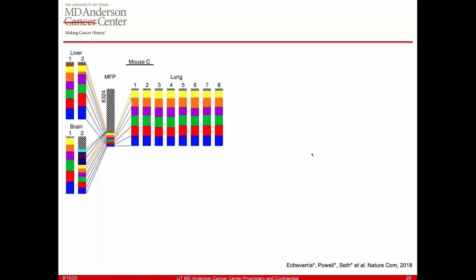Now, apart from looking just at the distribution, we can also track specific lineages. So here we are looking at the top lineages, represented color-coded. What we see is it's actually the same set of lineages which are represented in lung and liver. The yellow, orange, purple, their numbers and the fractions also remain somewhat similar. Although they are a rare fraction, it's very interesting to note that at least in lung and liver, there is a lack of evidence of organ tropism.